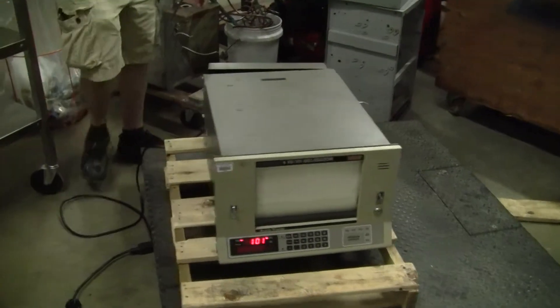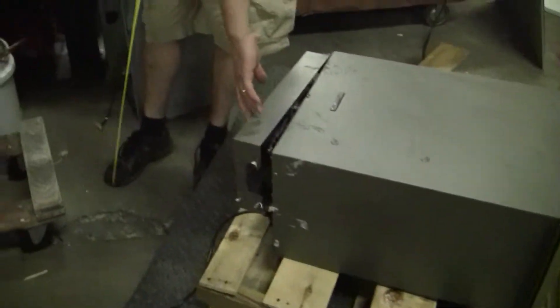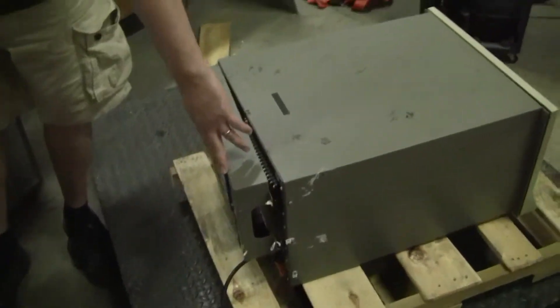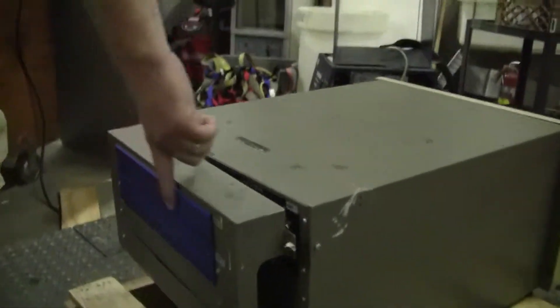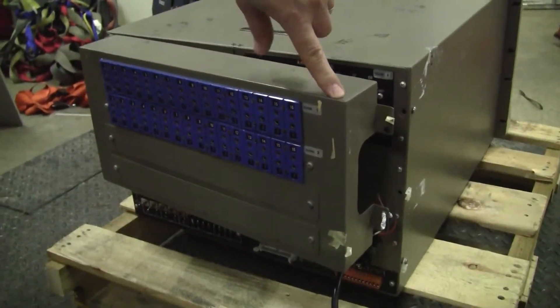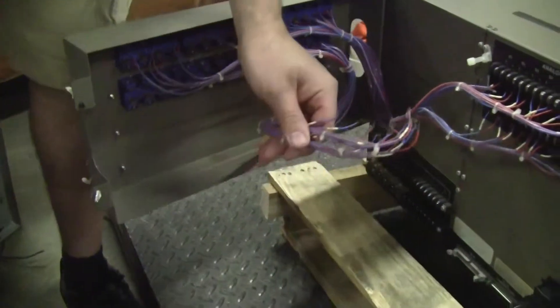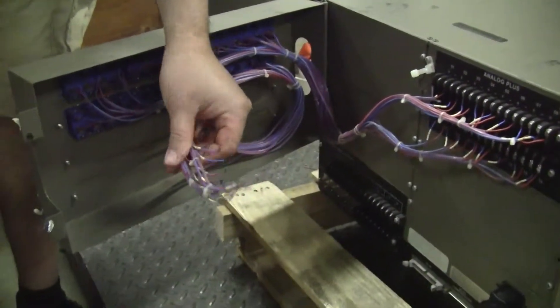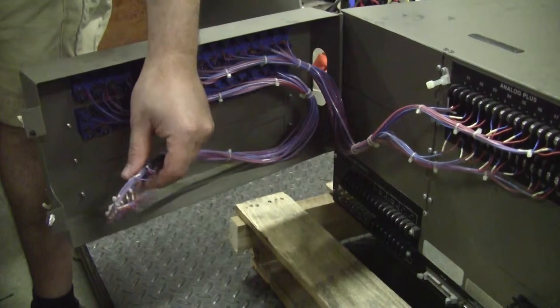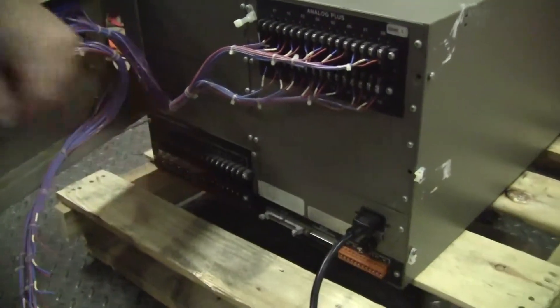In the back, let's take a look at all the thermocouples in the back. A lot of thermocouples in the back. They're all cut, which is okay. Analog inputs, auxiliary inputs.